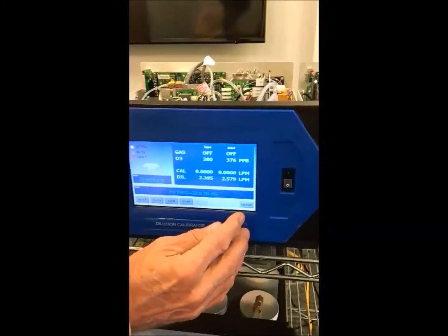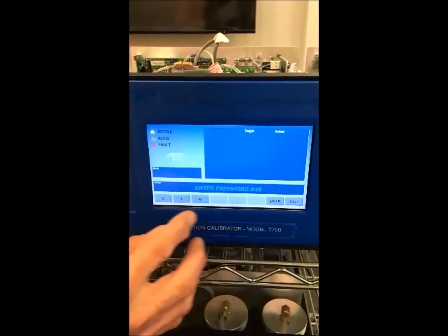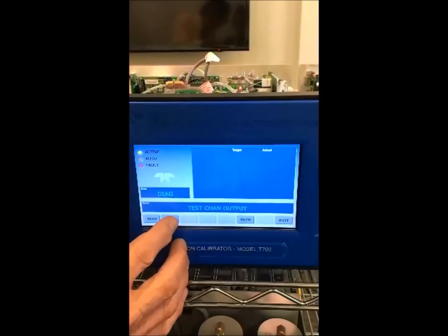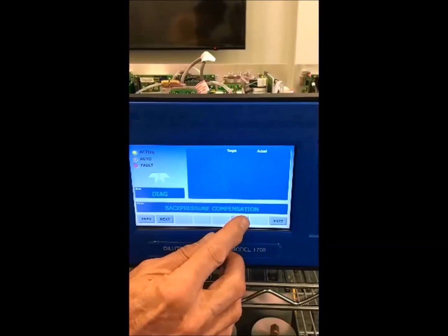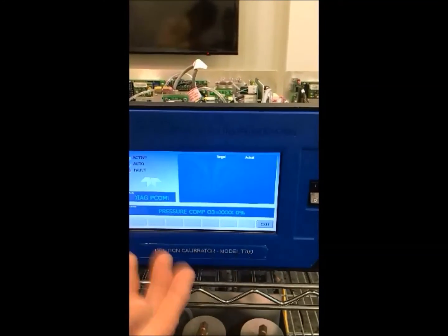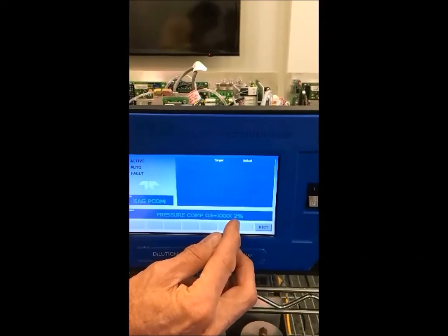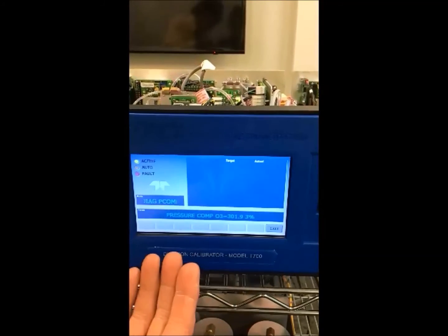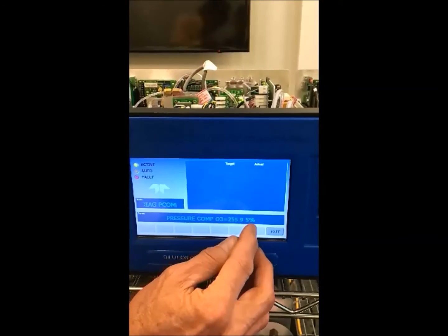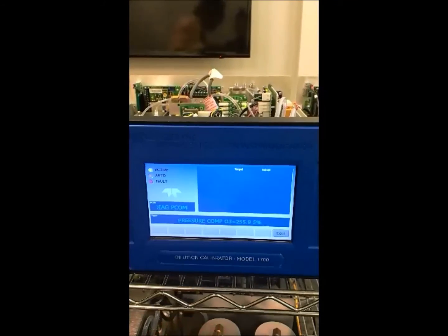The way you do a back pressure compensation is you go to Setup → More → Diag, then go over to Back Pressure Compensation and press Enter. Here you'll see a progress counter — we can see it's at 2% now. This takes somewhere in the order of 5 minutes or less. You can see it's starting to get readings at 3–5%. I'll come back after it's done and we'll finish this presentation.